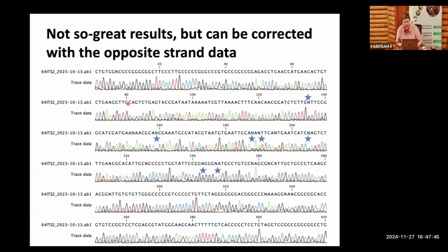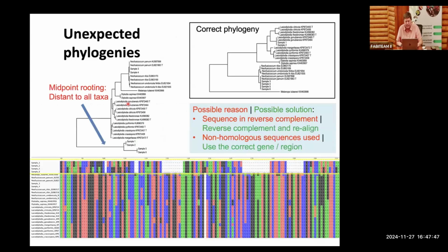Okay, here's just an example, that same example that I've discussed. Here we have that fantastic discovery that you've made. And I can tell you, most of the time when I see this, I know something is wrong with the orientation of your sequence, or you have sequenced the wrong gene. Typically, it's the orientation of the sequence. Most people know they get the right primers.